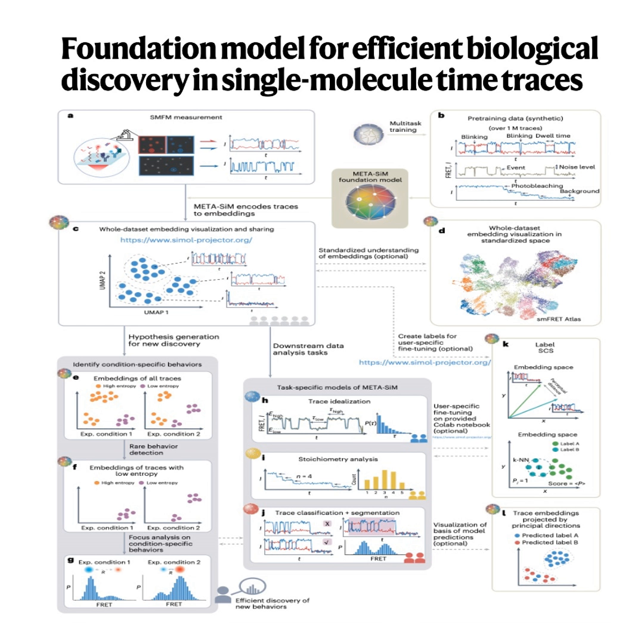It's a heavy lift. And even the standard tools researchers use can fall short, right? Definitely. Things like FRET efficiency histograms, FRET being Förster resonance energy transfer, that molecular ruler measuring distances. Well, those histograms are useful, but they can totally hide a really important step if, say, only 5% of your molecules actually do it. So a minority state gets completely lost in the average. Precisely. Especially in complex processes like pre-mRNA splicing or translation. There are so many steps, so many potential rare states. They just vanish in the standard plots.